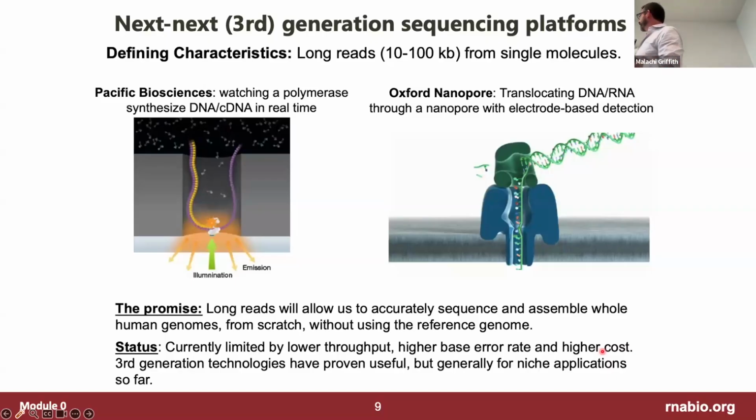This is a very old idea, actually, that has taken decades to perfect or to work towards perfecting. It is still not perfect, but it has really started to become an interesting way to generate transcriptome data. Unlike the Pacific Bio and Illumina approaches, this one is actually capable of directly sequencing RNA, and it's also capable of detecting modifications to nucleotides. So it has the potential to give you more rich information and to allow direct RNA sequencing. It has some challenges, though.